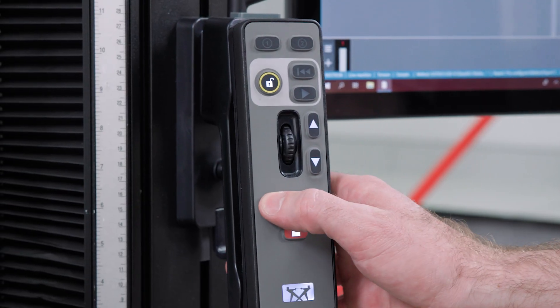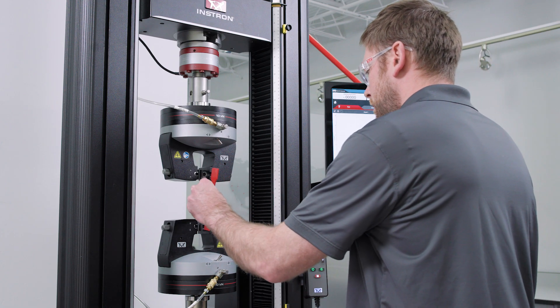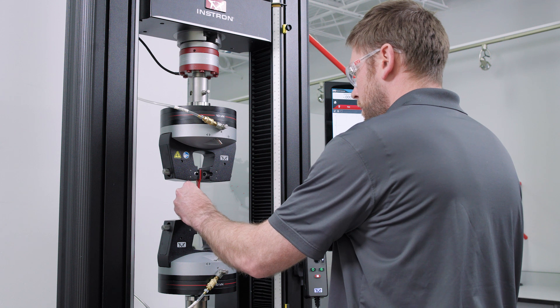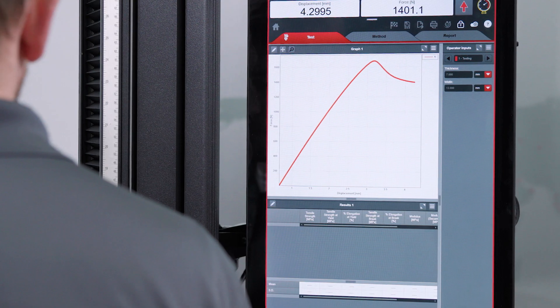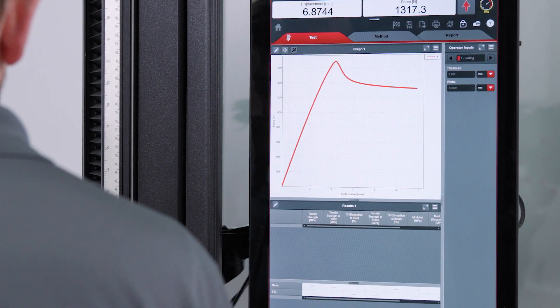So, what is Specimen Protect? It's a feature on all of our 6800 series systems and retrofits that allows an operator to remove unwanted tensile or compressive forces on a specimen prior to beginning a test. This is important because those unwanted forces can affect your test results.